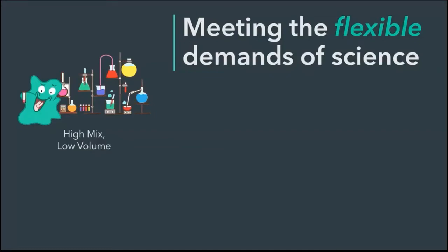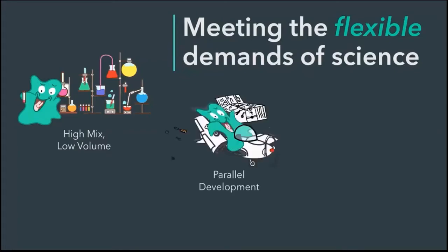Now, most of our primary assays are pretty locked down. They're a set of canned steps for which we've optimized the parameters, and we're simply choosing which map files to use and which steps to run when. However, sometimes we may be asked to implement automation for a scientific process that itself isn't 100% developed yet. Here, we run into a scenario where we're trying to automate a process alongside its optimization. The question being, can we develop automation in parallel with developing science?